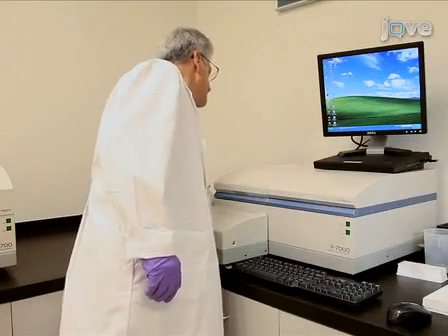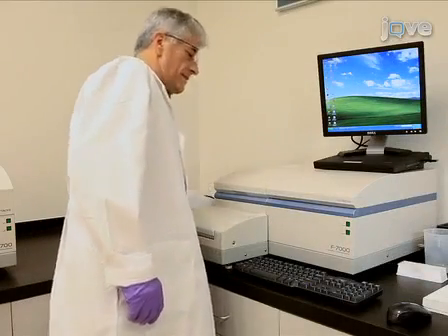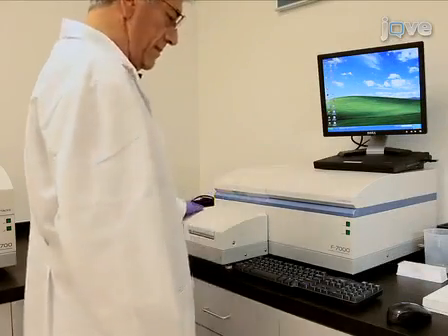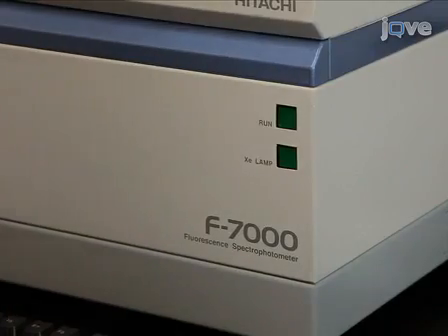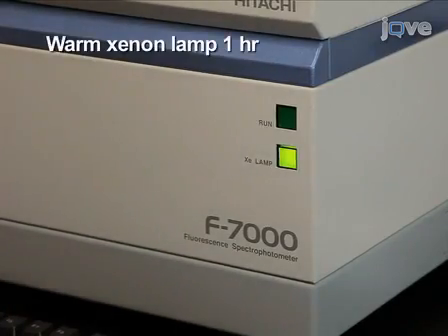Turn on the Hitachi F7000 spectrophotometer to allow the xenon lamp to warm up for one hour.